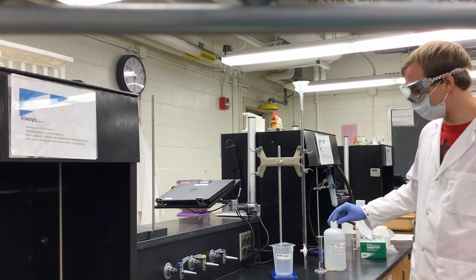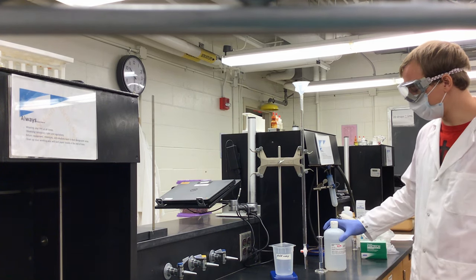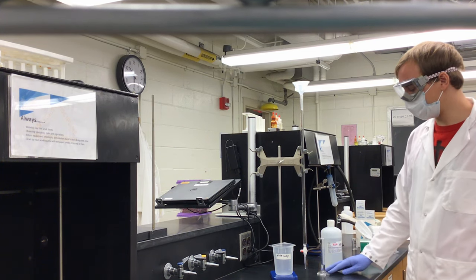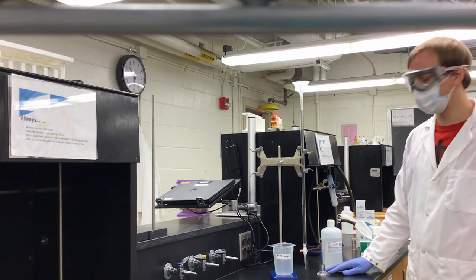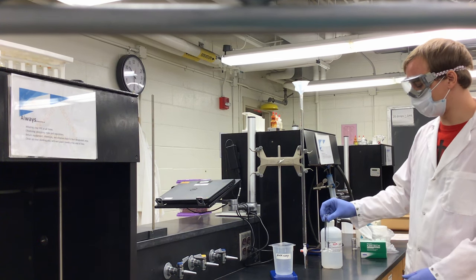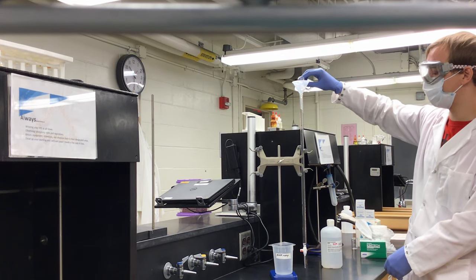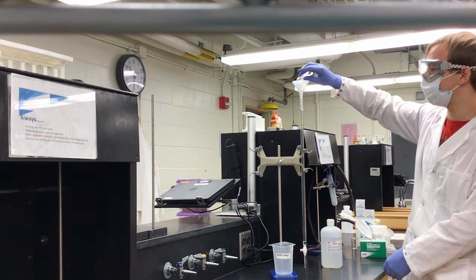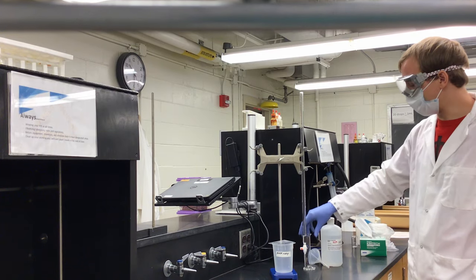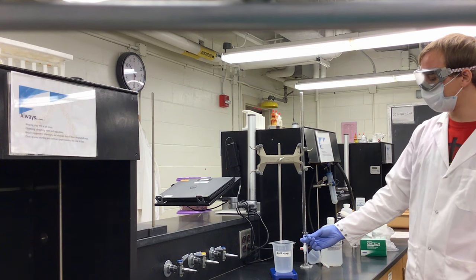In this case our titrant is 0.1 molar sodium hydroxide. We need to rinse the burette with our titrant in order to prevent any of the titrant from being diluted later when we are titrating our samples. I have pre-measured three milliliters of sodium hydroxide in my graduated cylinder, and I'm going to add them to my closed burette. The three milliliters has filled my burette to about where my thumb is.